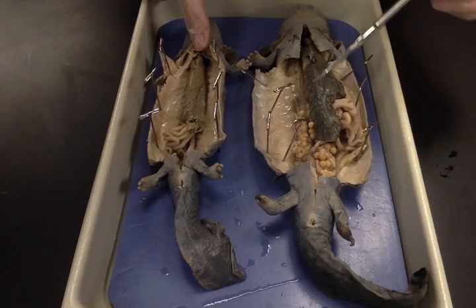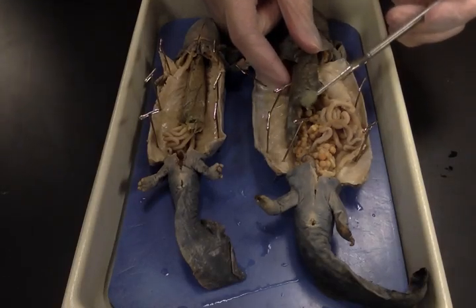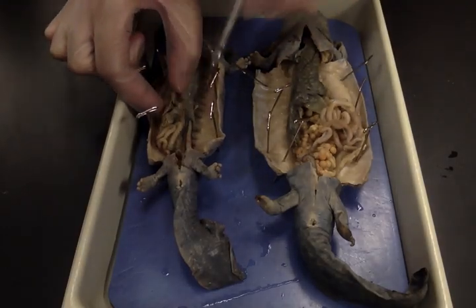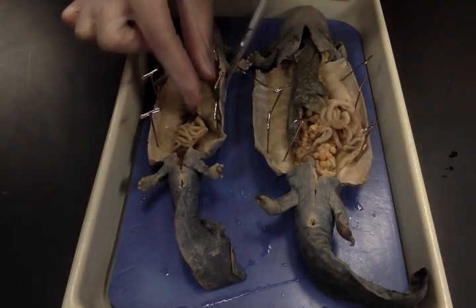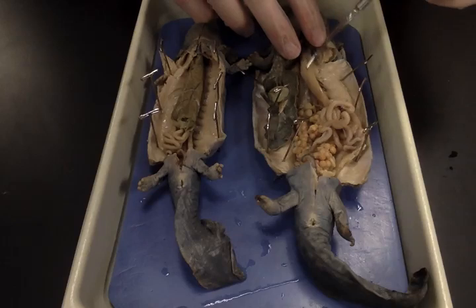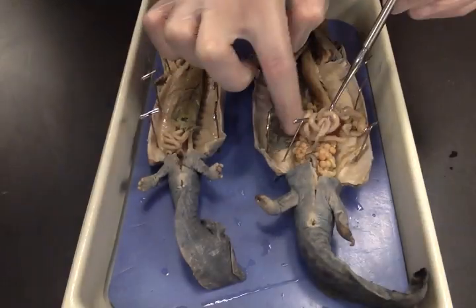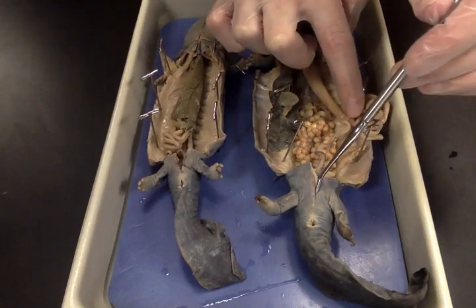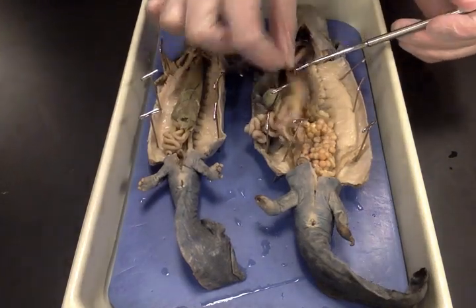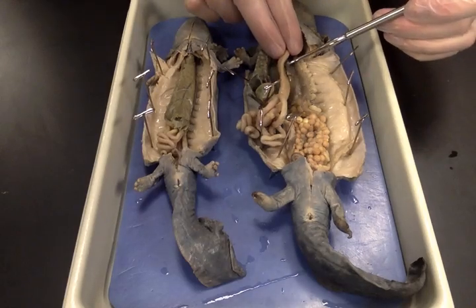The dark structure across the top is the liver, and attached to the liver you have the gallbladder — it looks kind of like a water balloon. They each have a gallbladder. Underneath the gallbladder you have the stomach, and the stomach leads to the duodenum, then to the intestines, and the intestines eventually go out the cloaca.